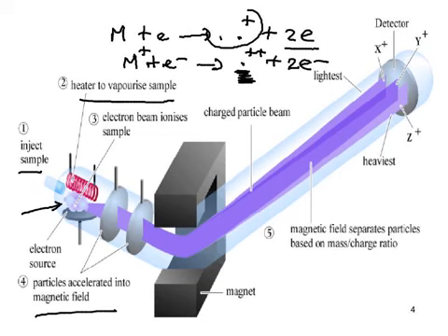This is known as the molecular ion. That's the molecule itself with an electron knocked off. It will have the same mass as the molecule itself, since the electron knocked off has negligible mass. Now, once we've formed these so-called molecular ions, and indeed some of the M++ ions and some fragments will have been created as well, all the positive ions will start streaming in this direction.